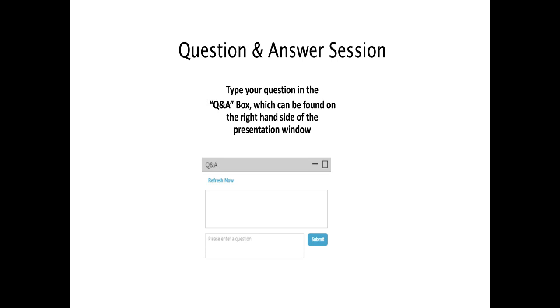But again, depending on the chromatographic parameters, there's no reason why the response should be any more or any less in HILIC than it is in reverse phase. Obviously, you've got considerations of your analytes and the concentration of those. So I hope that offers some explanation.